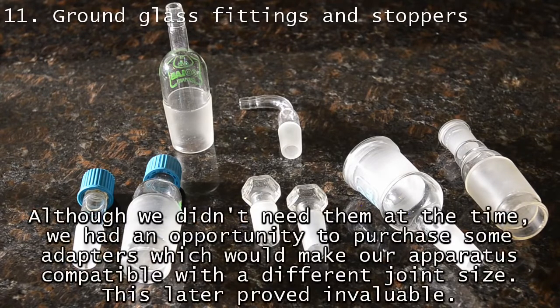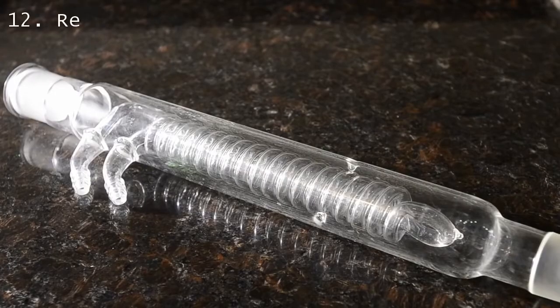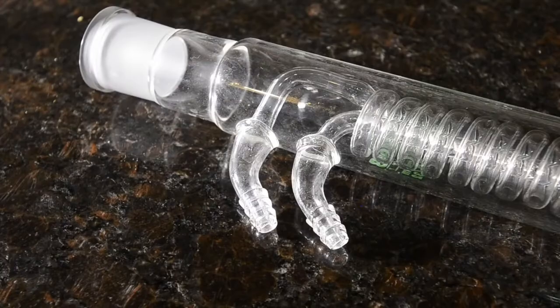Many reactions call for reflux, where the solvent constantly boils and condenses. You can use a Liebig condenser for this, but it's not very efficient. We prefer to use a specialized coil condenser, as you can see here. Just keep your eyes peeled and buy one when you find one.